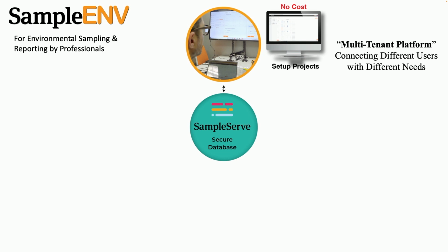The first part of our platform is the project management tool. That's where the project manager is going to set up their project. This is where they're going to input their sample location and well construction information. They're also going to connect to the laboratory they're using, more on this later. They're going to pick the analytical parameters they want to test for and select the dates they want to sample on. They can even schedule specific field technicians for that sampling.